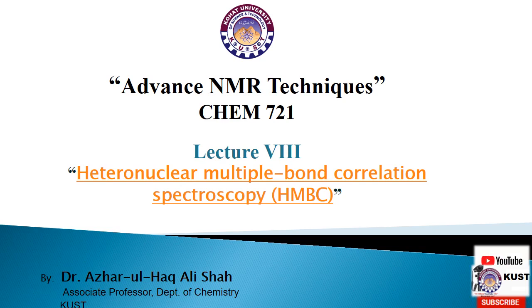Today we are going to discuss another technique, that is HMBC. HMBC stands for Heteronuclear Multiple Bond Correlation Spectroscopy. As the name indicates, this technique gives information on correlation between heteronuclei, that is proton and carbon, that are 2 or 3 bonds apart from each other.